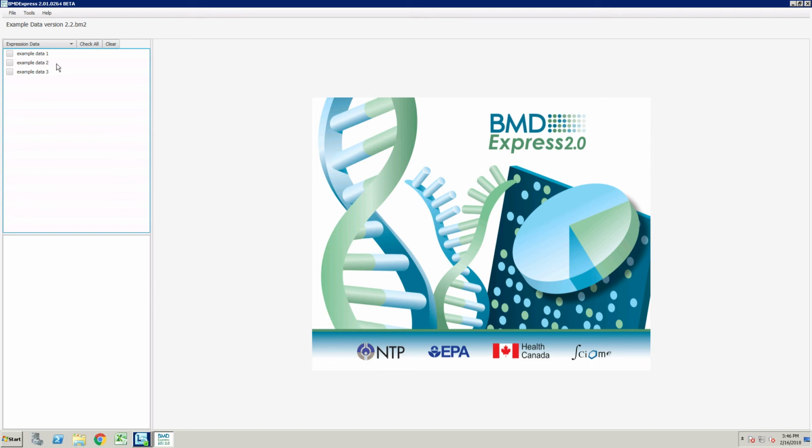It'll iterate going through the actual loading process, so you'll have to go through, is this log2, and what platform is it, and is this log2? So you can actually load multiple platforms at the same time, and if you have different log values and things like that, you can load those also. But it'll just iteratively walk through each one of the files you load.